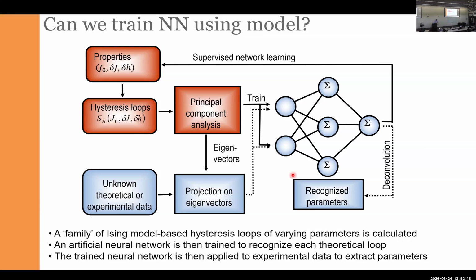Notice that the same type of logic applies no matter what you do with the microscope, because sometimes we take the known sample and use it to calibrate the microscope. In this case, we believe in the sample, but we use the belief in the sample in order to improve the microscope. And sometimes we have the microscope that we believe and look at the unknown sample. So obviously, and I will show you an example on Friday, there are cases when we absolutely believe both in the sample and in the microscope, and the predictions are very much not aligned, and then we have to question our understanding of physics.